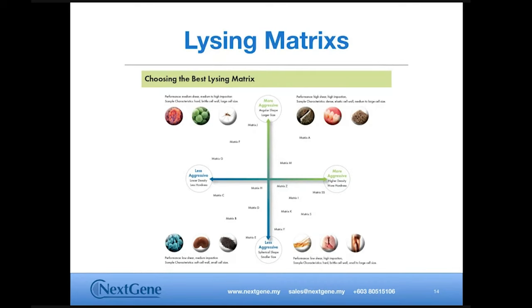Unless there is some pre-processing that can help to remove those unwanted organisms and then enrich for the virus particles, then it will help to get more NGS information that is on the virus only. So it might help increase the chance, but again, it will still be very challenging because we are not sure about the proportion of the virus versus, let's say, the other things that are living in the same sample.